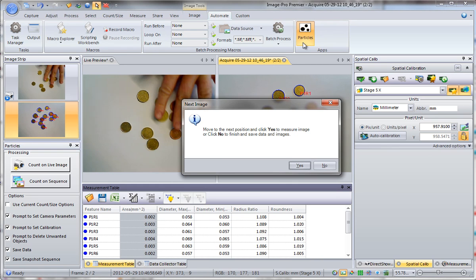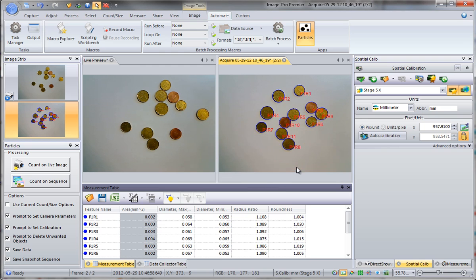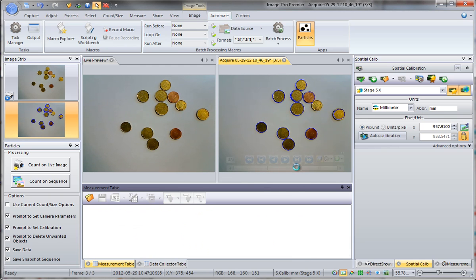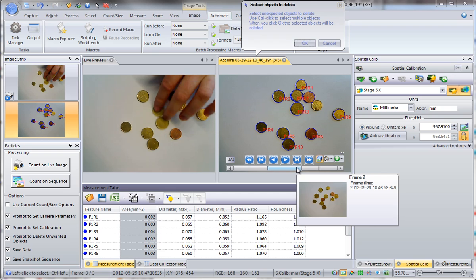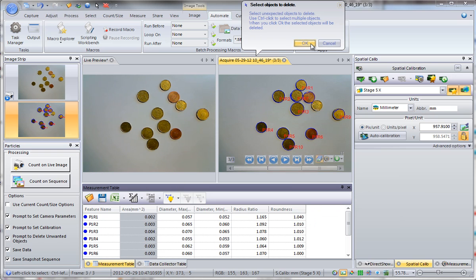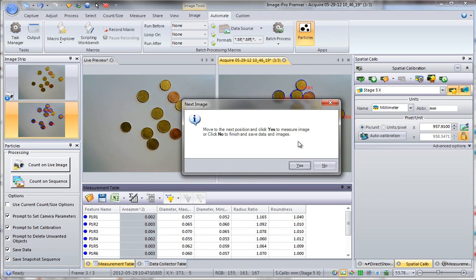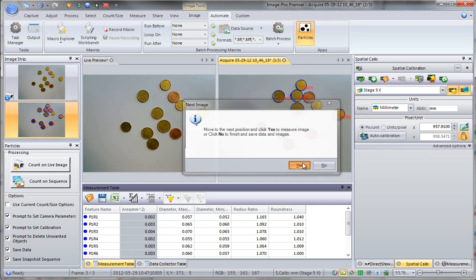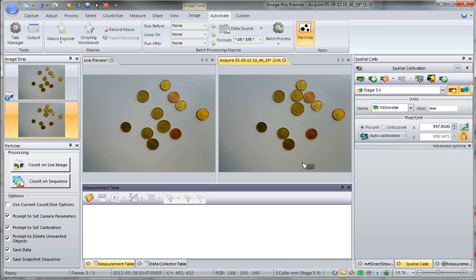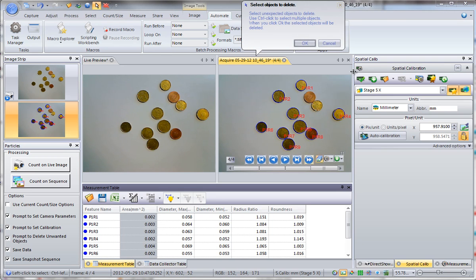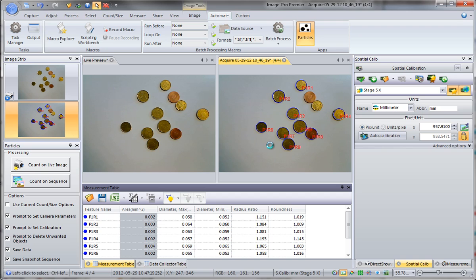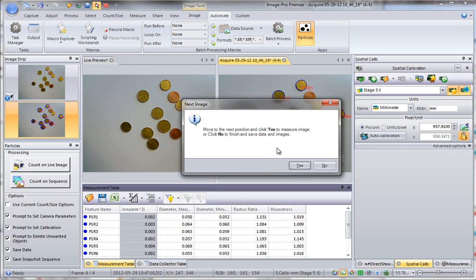You proceed through the next frames — clicking 'Next Frame' for each one. When you are done, just click no here.